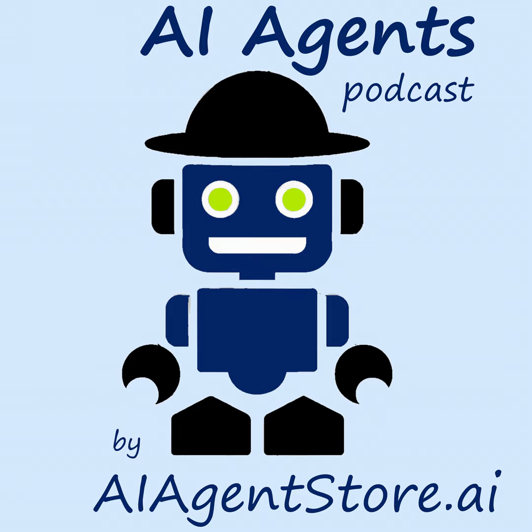That's the goal. So here's a final thought for you today. Think about how this increasing precision and autonomy of AI in diagnostics might reshape the human roles in labs. Interesting point. Yeah, could it free up the experts, the scientists, to focus even more on the really tricky stuff? The nuanced analysis, complex problem solving, the cases that really need that unique human insight. It certainly could shift the focus. More complex work, less routine checking.